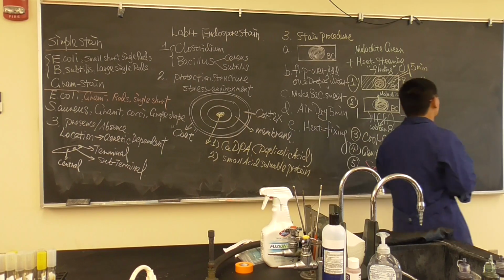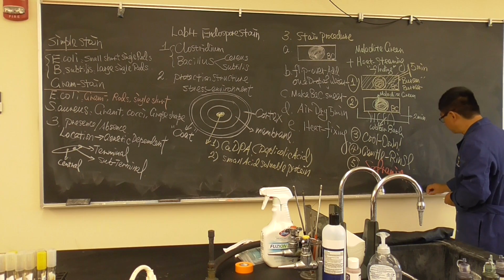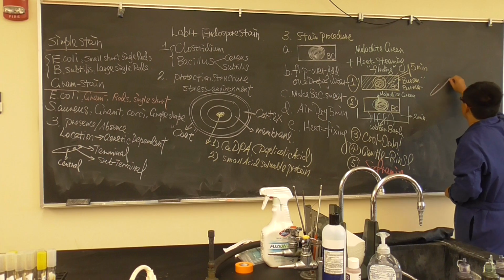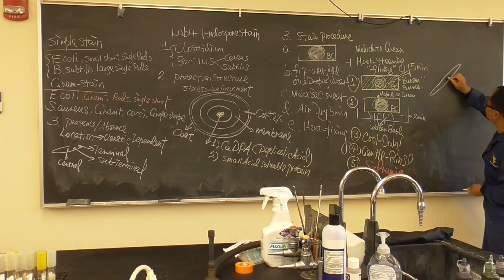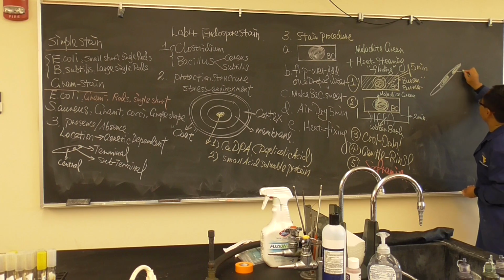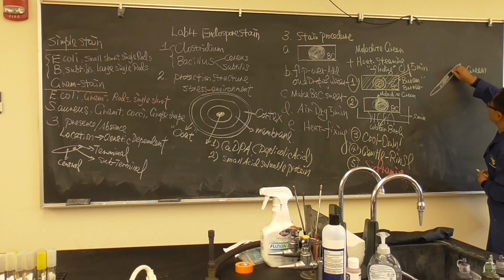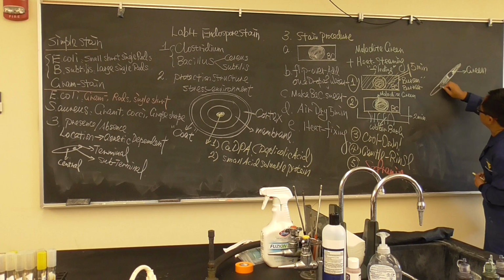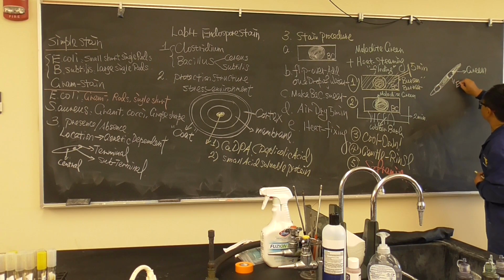Now, what is the endospore going to look like? I tell you, majority of them will not look like your picture. Not the picture like an artist's drawing in your textbook, no. It will be very similar. You're gonna see a bunch of green. Okay, they are all green here because of malachite green. You will see there is a big bubble-ish thing right in the middle. Right here. This is the kind of thing like an endospore.